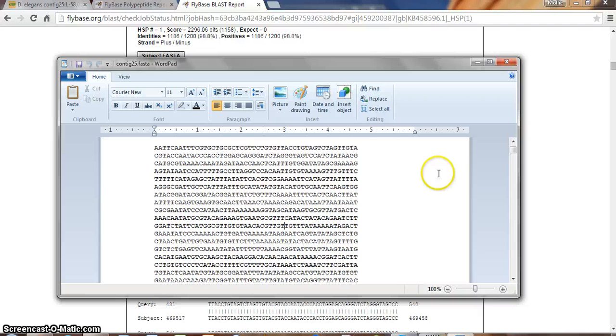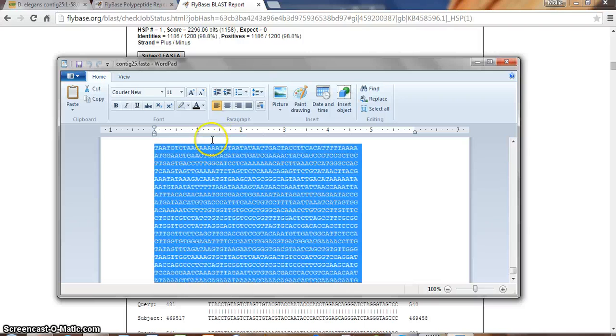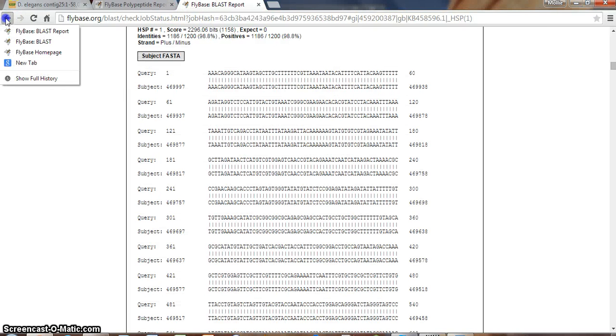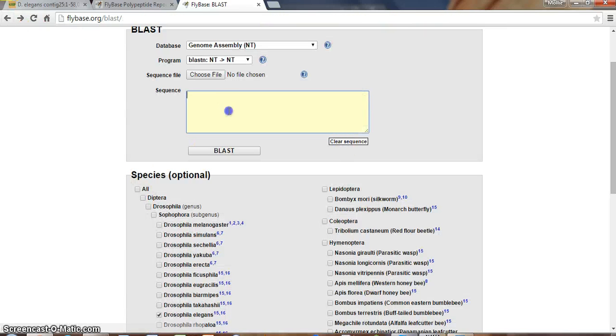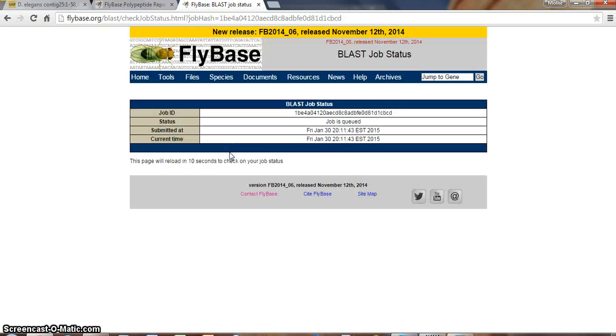Okay, so I'm going to just scroll down to the end of my Contig, take that many, and go back here and blast it again. All right, so I'm gonna clear this, throw that in there, and do this again.